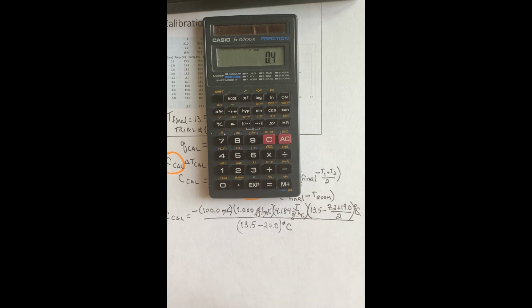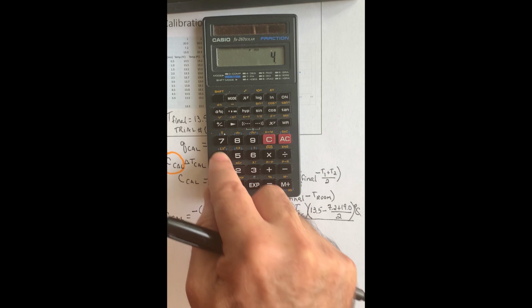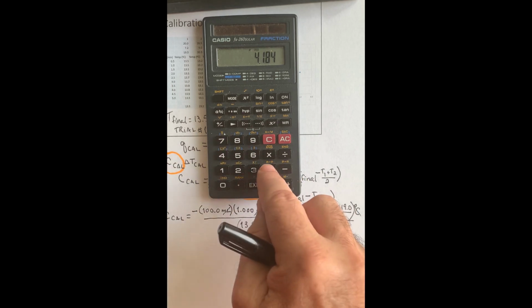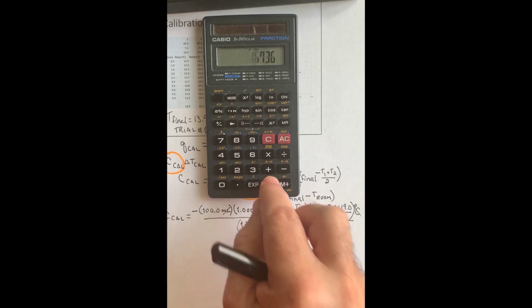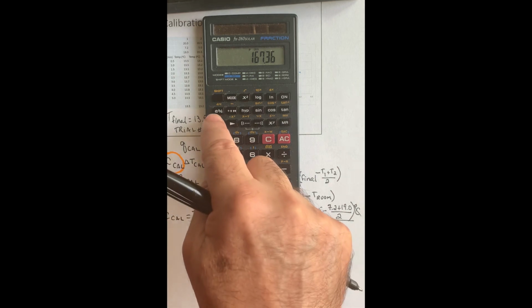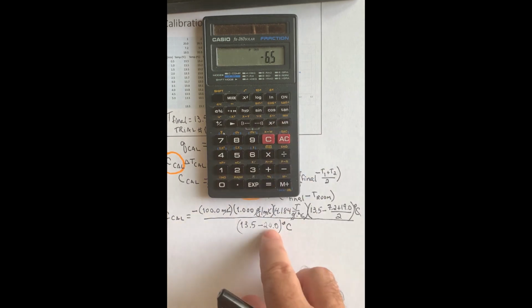Again, I apologize for the seemingly convoluted way of doing the calculations, but like I said, I have a very simple calculator here. So I'm going to multiply this times 4.184, right? Times 1 gram per milliliter times 100 milliliters, and that gives me 167.36, which I now have to put into the negative. And now I'm going to divide that by what I had in memory, which was this difference here.